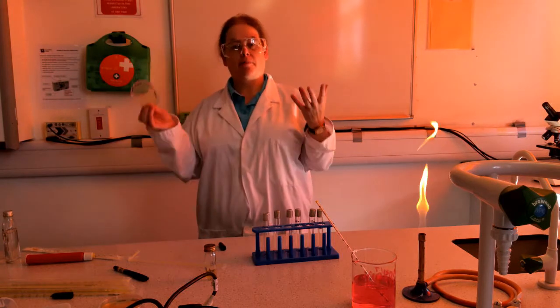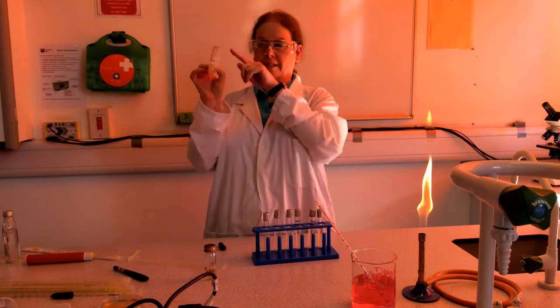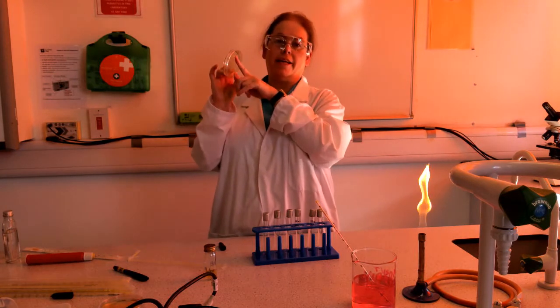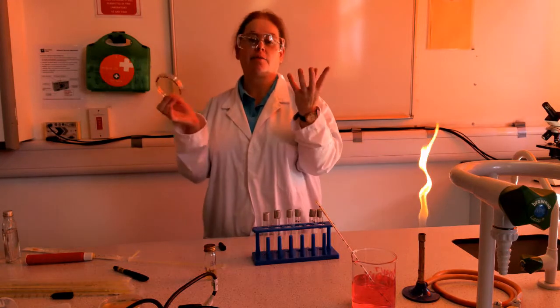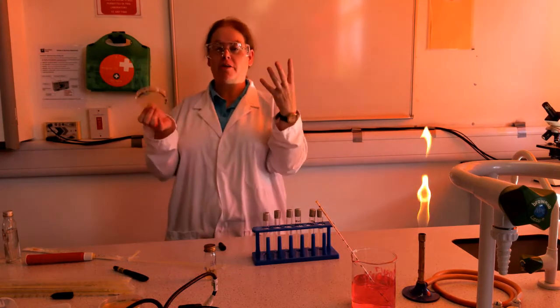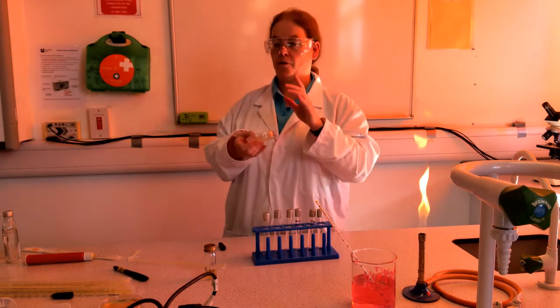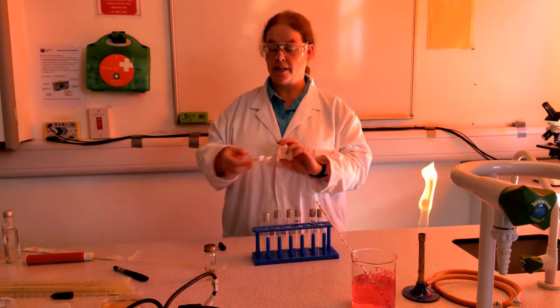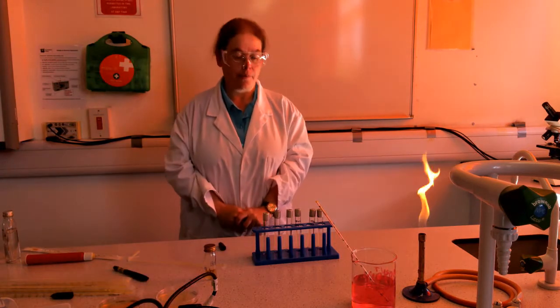Then we incubate the plate. And when we come back next week, where there was one bacterium on the plate this week, there's going to be a whacking great blob. But blob isn't a science word. The science word is colony. But you get the idea. There are blobs we can count. And I do have one over there that I prepared earlier. I will show you at the end of this video.